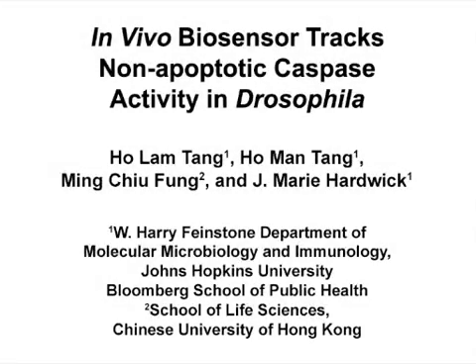The overall goal of this experiment is to detect and track non-apoptotic caspase activity in live animals using Drosophila melanogaster as a model. Caspases are proteases that cleave many cellular components to cause apoptotic cell death. Therefore, the presence of active caspases in cells is often assumed to reflect impending cell death.